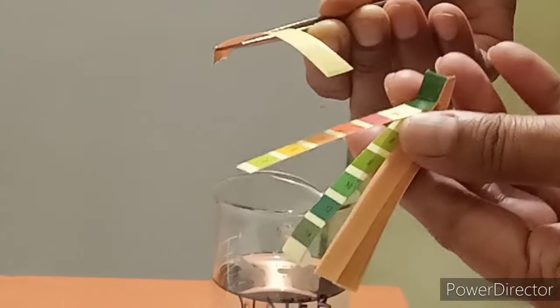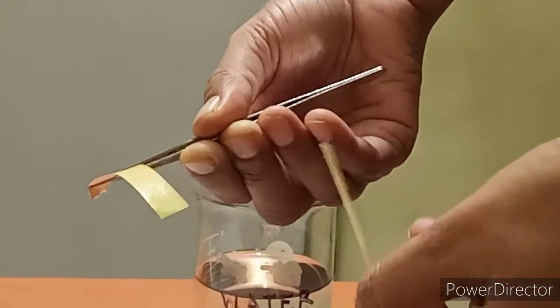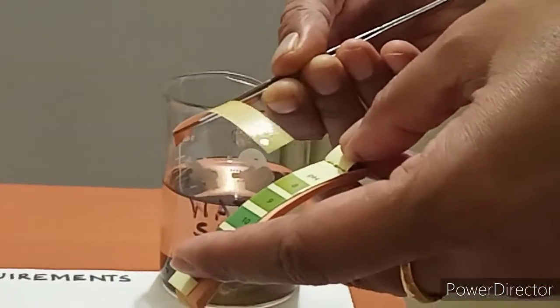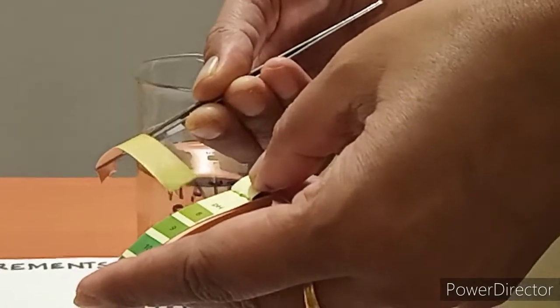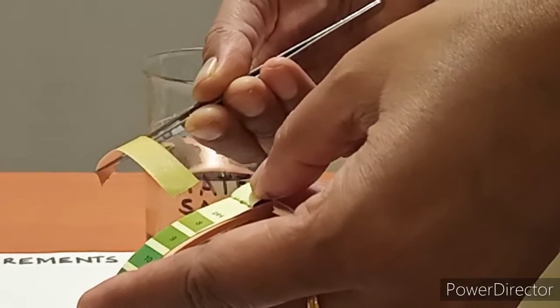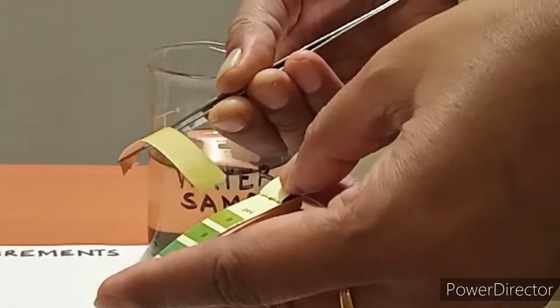Let it dry for some time. And then you can match it against the range with a shade card. And then you can see that the pH of this aquatic body is somewhere near 8. And again, we can match it with the narrow range pH paper to get the accurate number.